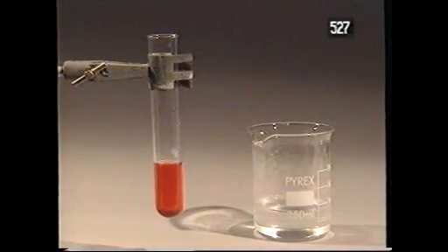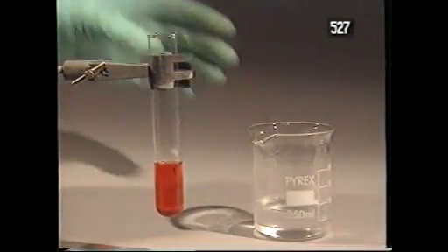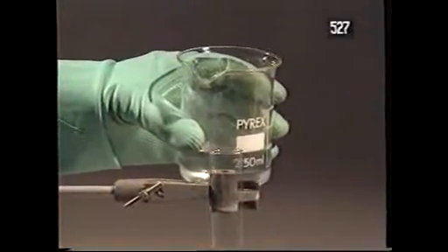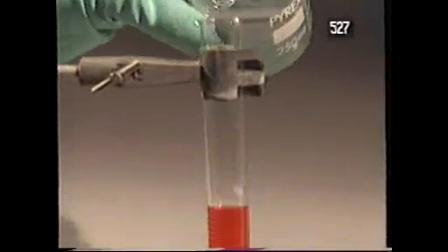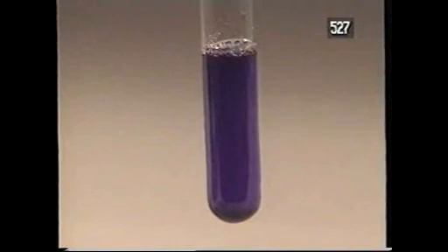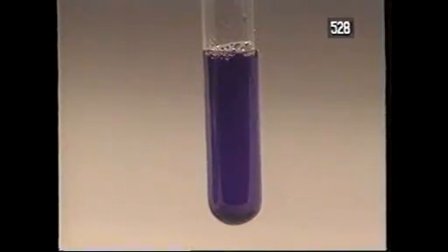What I want to show you is that this lime water, calcium hydroxide solution, changes the colour of litmus. Acids, remember, turn blue litmus red. Calcium hydroxide solution turns red litmus blue. Substances that do that are called alkalis. Calcium hydroxide is an alkali. An explanation of this word alkali comes from trees and plants, because alkalis were once made by burning them. The word comes from the Arabic, al-qali, roasted ash.